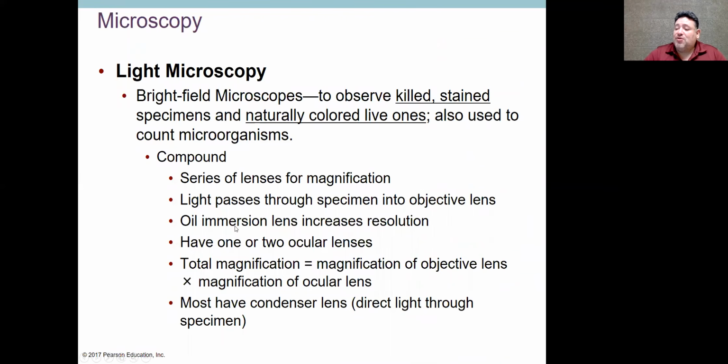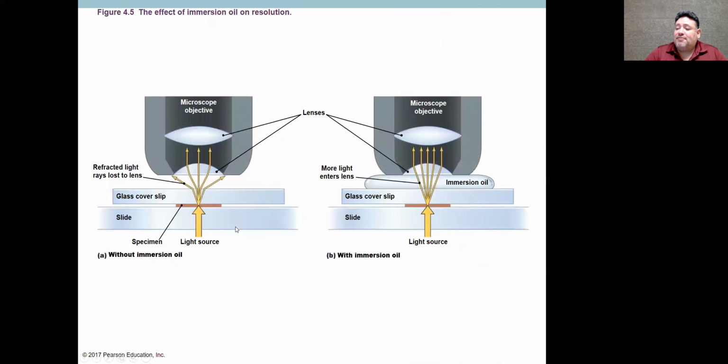We usually use oil immersion. So what does that mean? That means that you have your slide, and you add a little bit of oil. See the oil here? This slide allows you to contrast what's happening in the objective in the absence of the immersion oil versus the presence of the immersion oil. Here you can see that there's at most about 3 rays coming from the specimen. By contrast, here we have about five different rays coming from the specimen.